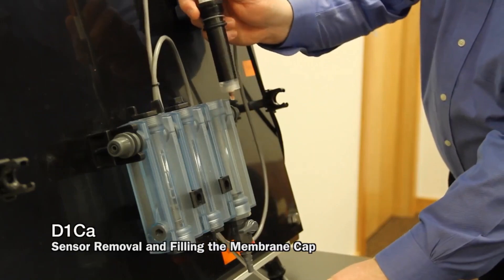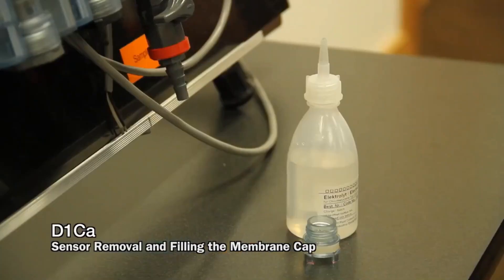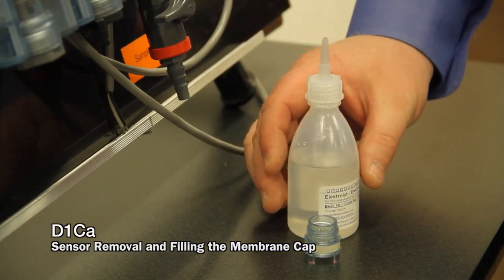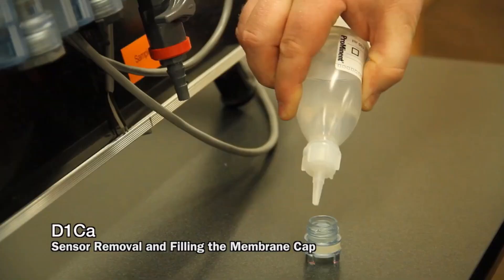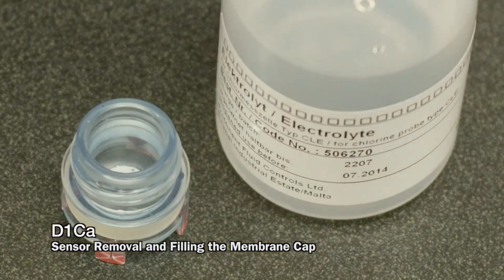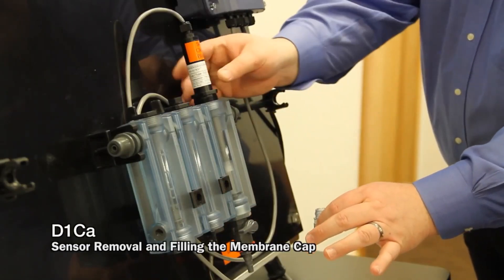Remove the membrane cap and set it aside. This particular sensor has a very water-like electrolyte. Fill that cap completely full, making sure there are no air bubbles down where the membrane is inside the cap.